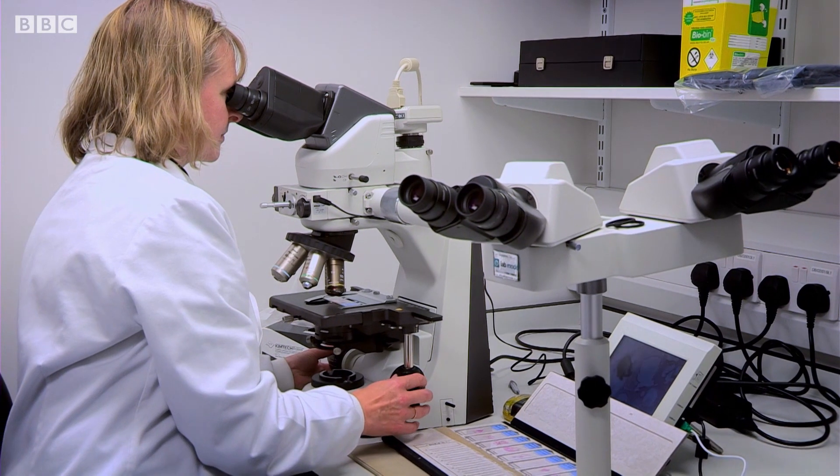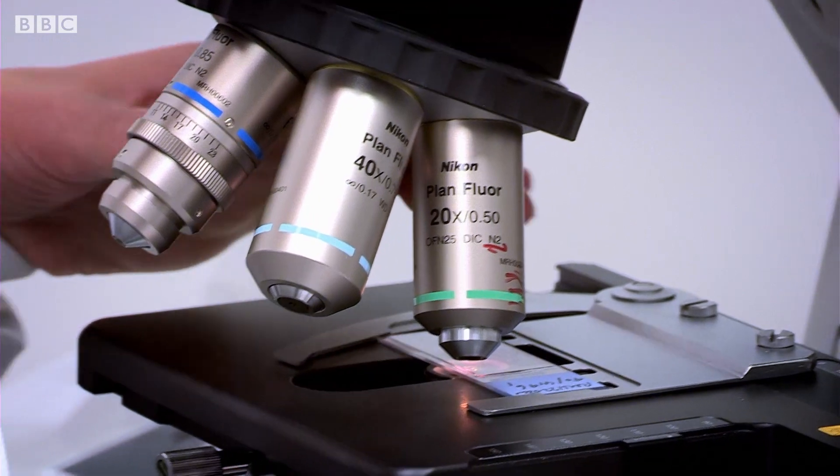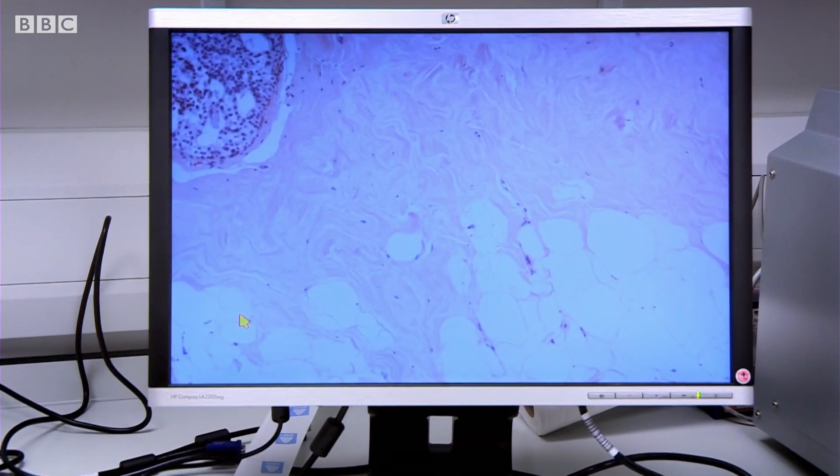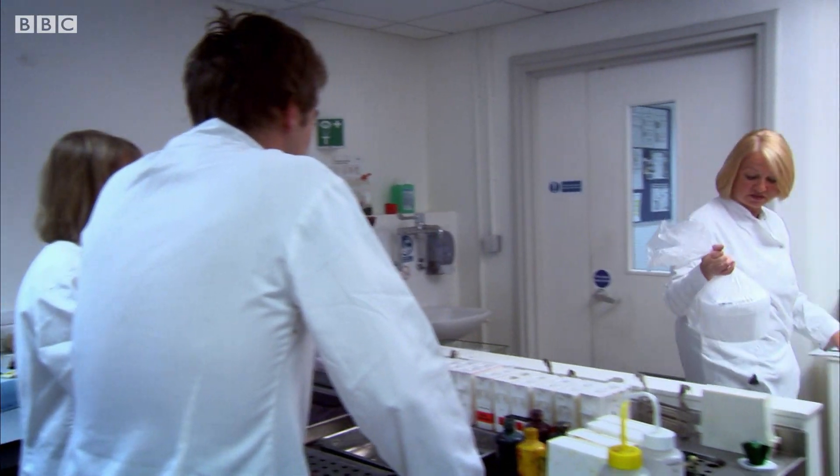Louise Jones is a pathologist who's helping to pioneer a brand-new breast cancer tissue bank. She works with tissue that's been taken from cancer patients. She receives a fresh sample: 'Hi Louise, I've got the tissue from the theatre.'